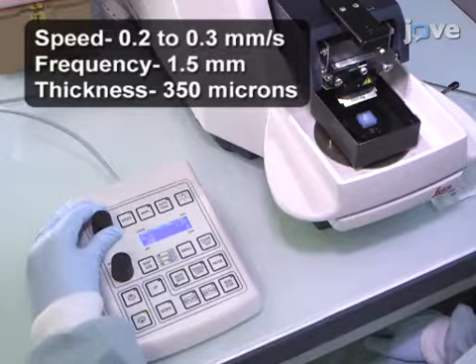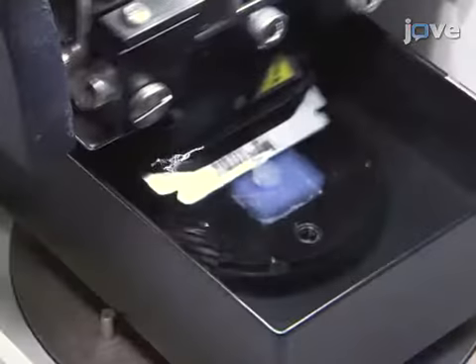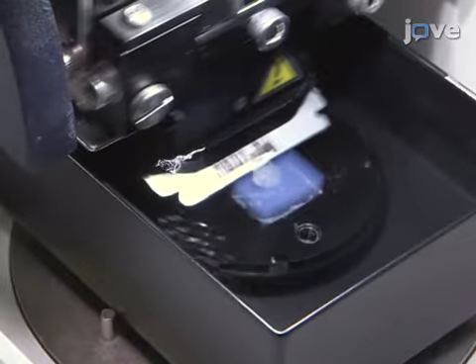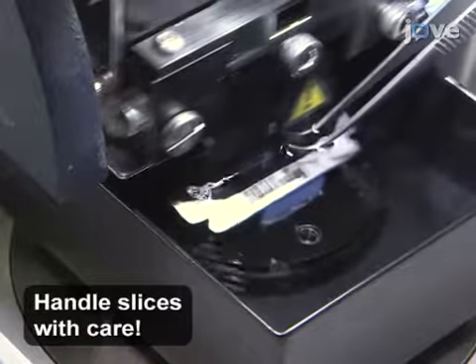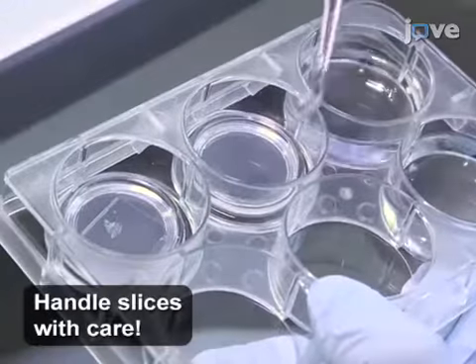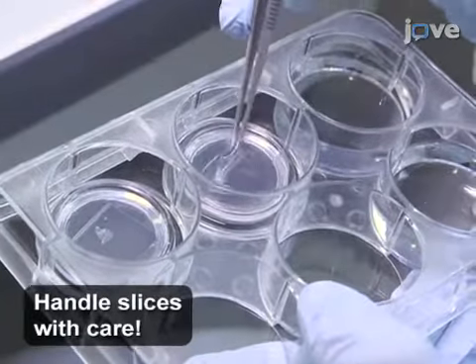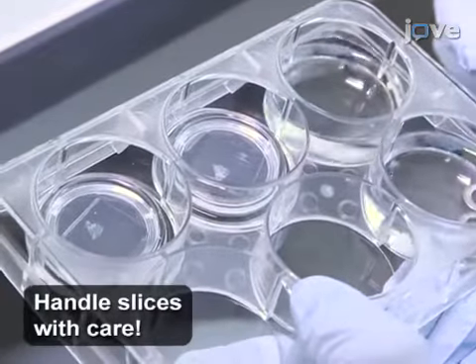Once the vibratome setup is ready, take out the 6-well plate from the incubator. Now, start cutting the mounted block into 350 micron slices using the vibratome. With the help of fine forceps, carefully collect the tumor slices as they are being cut, and place them flat over the cell culture inserts in the 6-well plate. Transfer 1 slice over each insert.